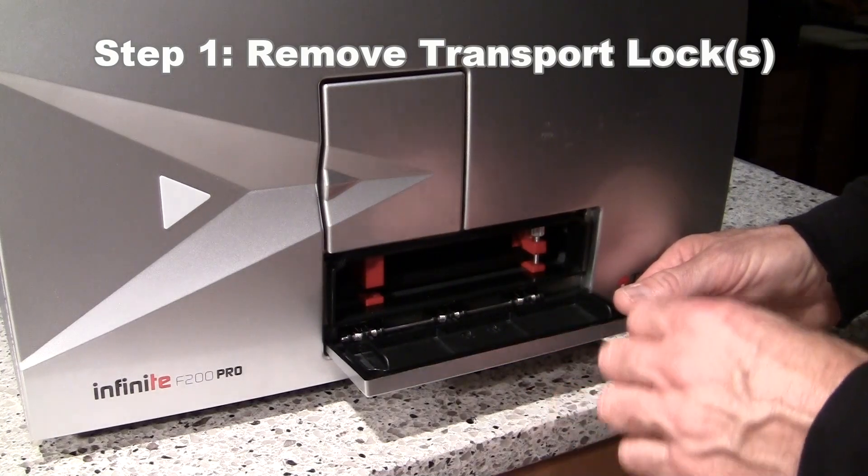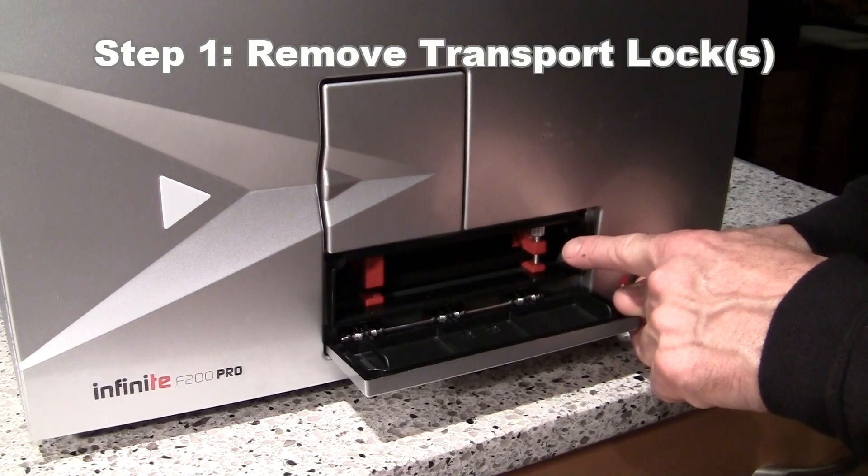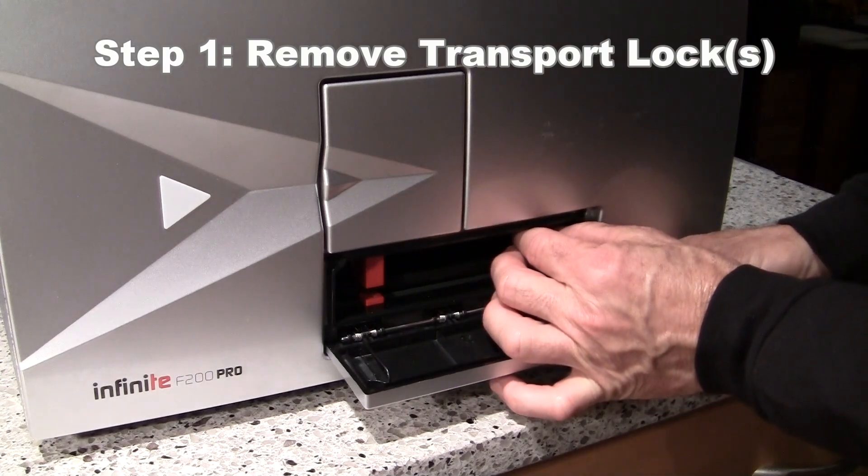Then you will want to back off the screw located here on the right transport lock, turning it counter-clockwise about one and a half turns until you feel that lock become loose.